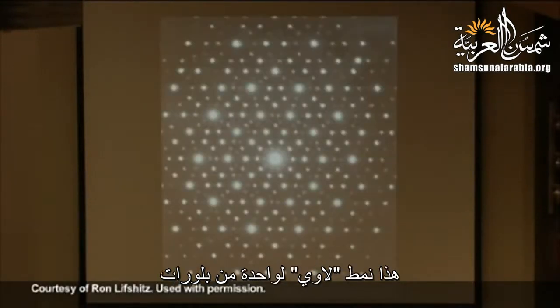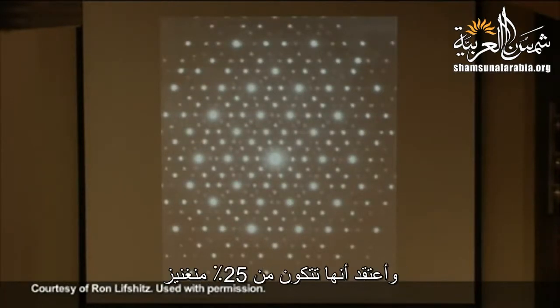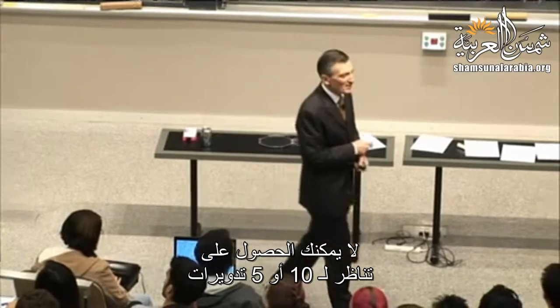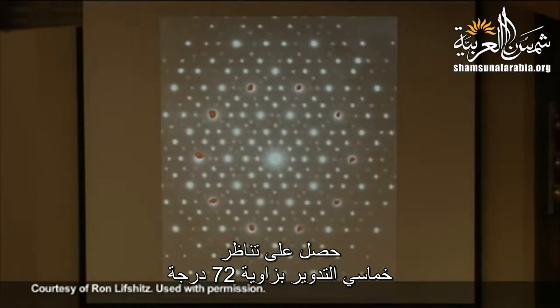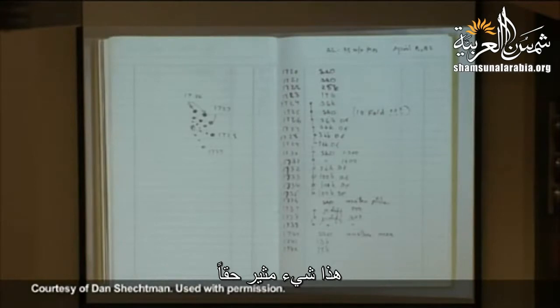So here's the X-ray pattern of one of Danny Shechtman's aluminum manganese specimens. I think this is 25% manganese in aluminum, if I'm not mistaken. So let's count. 1, 2, 3, 4, 5, 6, 7, 8, 9, 10. You can't have 10 or 5. Atoms don't work that way, but he got it. He got it. 5-fold, 72 degrees.